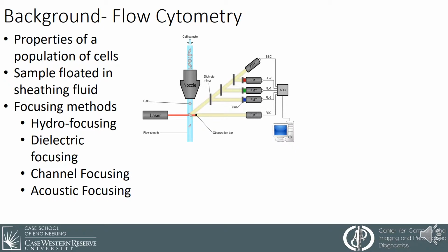From here, the refracted light is passed through a series of prisms and mirrors and collected by a series of detectors. These signals are then processed by a computer system in order to create a system of wavelengths that can then be used to categorize and evaluate the sample.